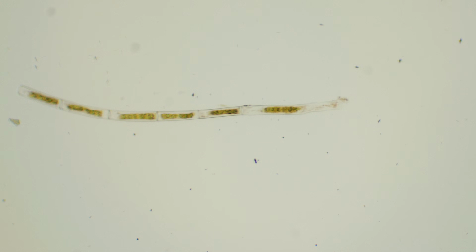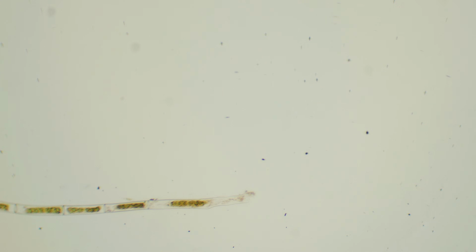And at this moment, you can even see a microscopic algae particle. I'm not completely sure, but I think this may be a fragment of filamentous algae. If we magnify this fragment even more, you can even see the cells inside the algae, while a tiny microorganism rushes past it at insane speed. And they are everywhere here. So, in my personal opinion, the water filtration only partly passed the test. I would not drink this water, and I would not recommend that you drink it either. Unless we were talking about extreme survival conditions, then water like this should definitely be boiled.